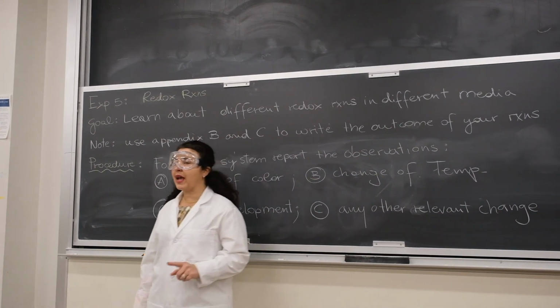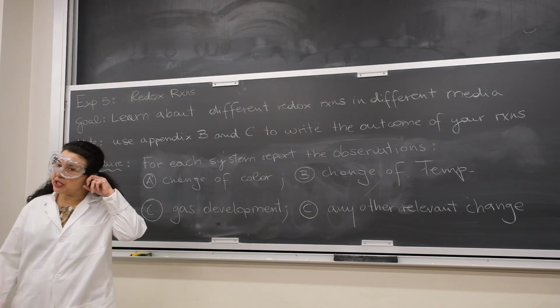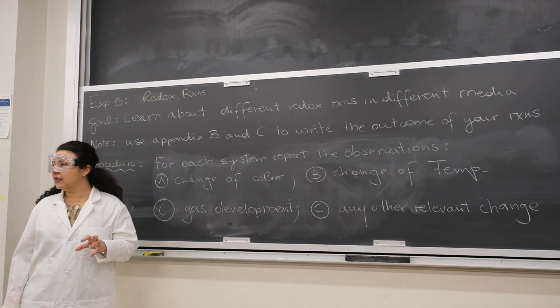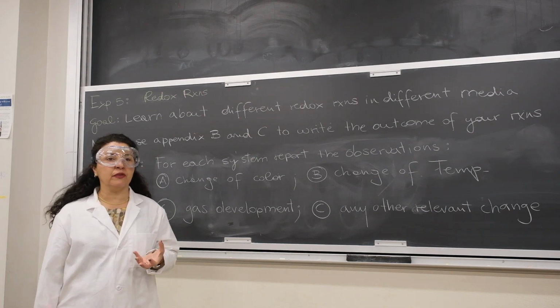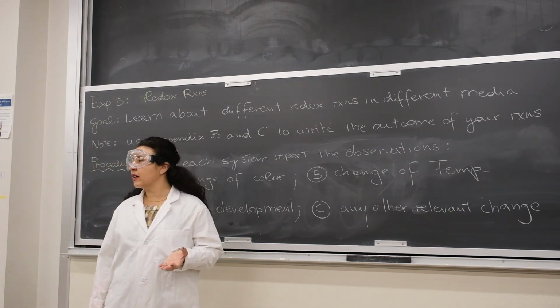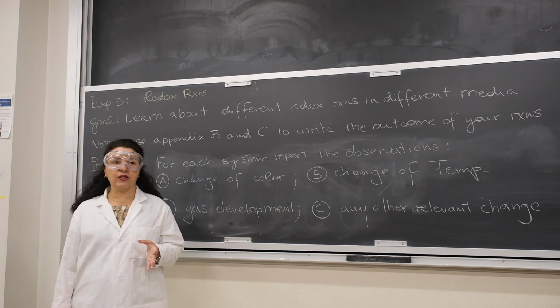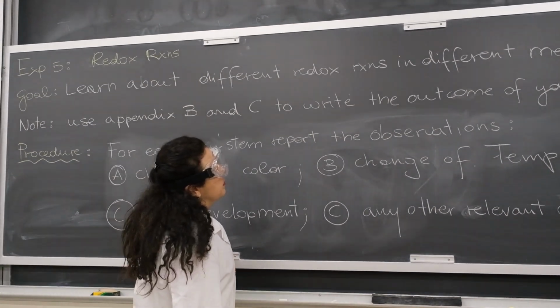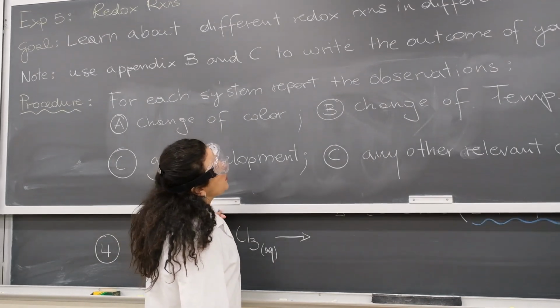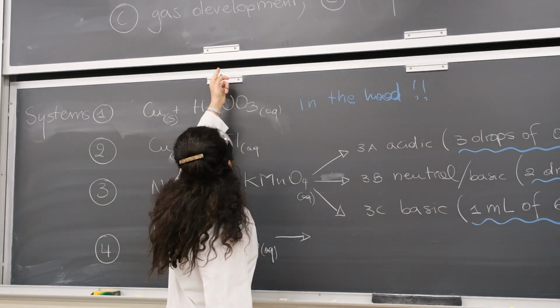There is one reaction that has an unexpected change. If you figure out what it is, so be good observers, you will get extra credit. So pay attention to all the changes that you can observe. Okay, so what are these four systems?